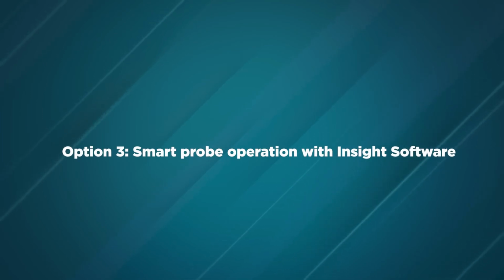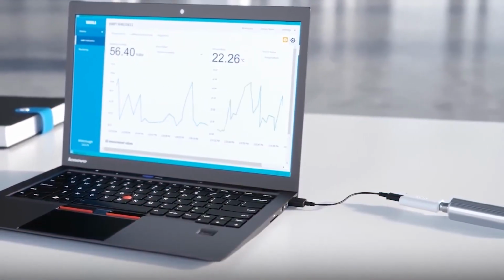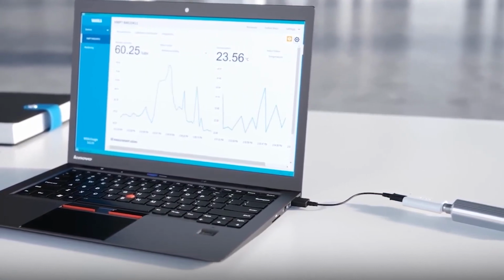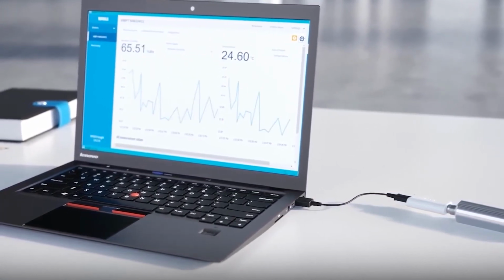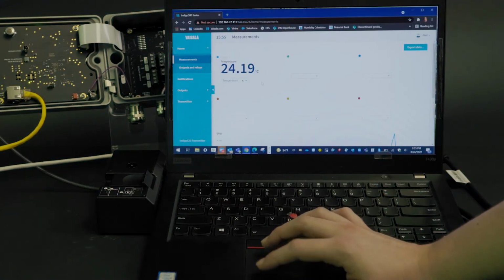The final option I'm going to review is to operate your Indigo Smart Probe off of a PC using our free Insight software. The Insight PC software is designed primarily as a configuration and calibration tool, but it does allow you to view live data from your probe, and it offers up to 48 hours of data logging, which can be exported to a CSV file.